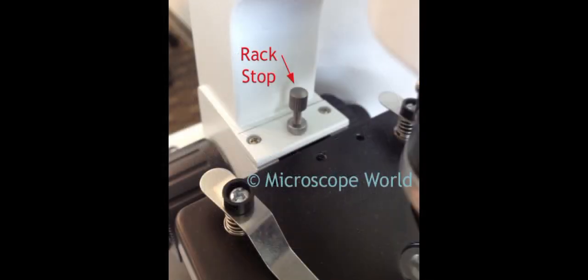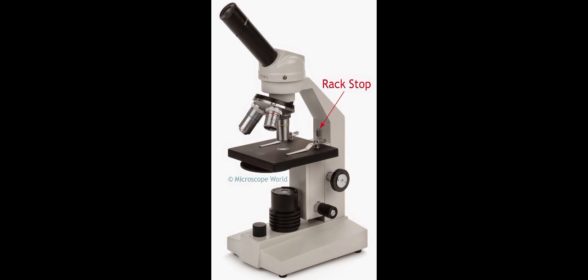Number 14. Rack stop. It controls how far the stage should move to keep the objective lens from going closer to the specimen, which could harm the specimen. It guards against the specimen rising too high and colliding with the objective lens.